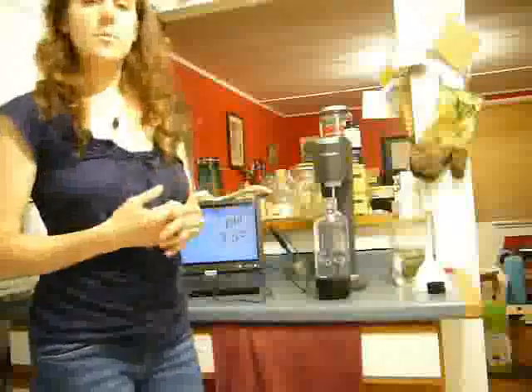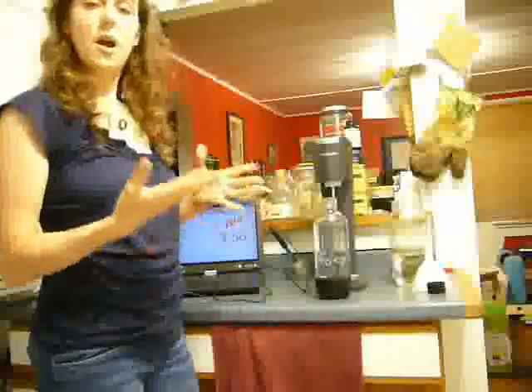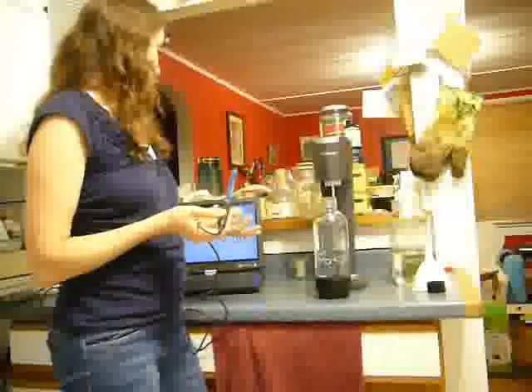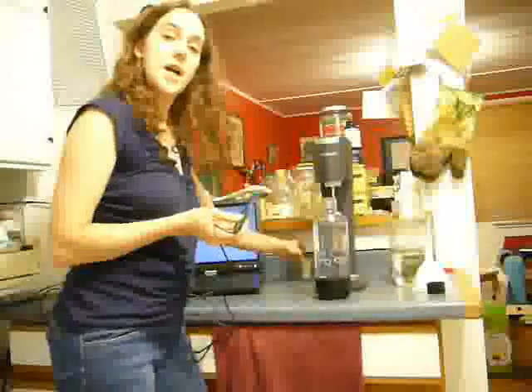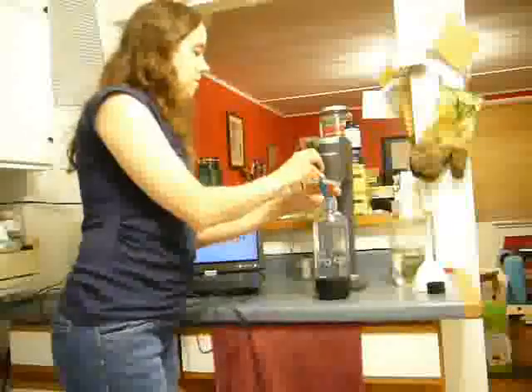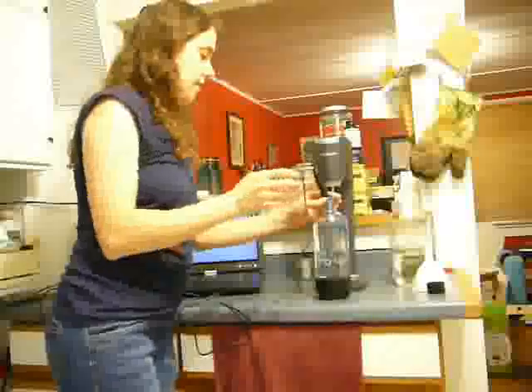But before I add the carbon dioxide, I really need a baseline. I need to know what the pH of the water is normally. So I'm going to take my pH probe here, and this is a digital probe, which will allow us to get a very accurate measure. Now, it was just in the buffering solution that helps protect the probe. So right now it's like a 3.85, so we're going to add it to the water and see what the pH of the water itself is.